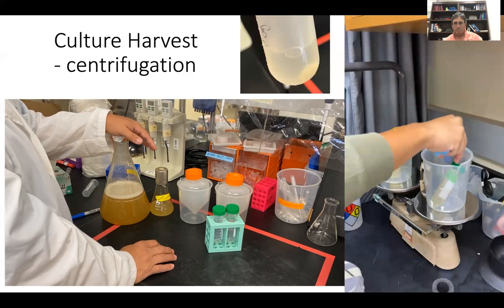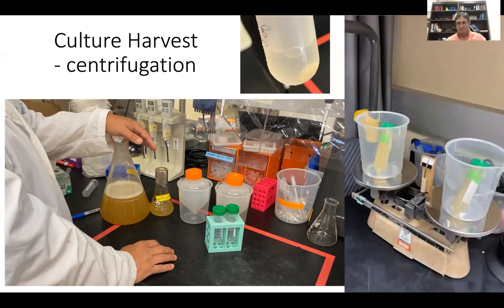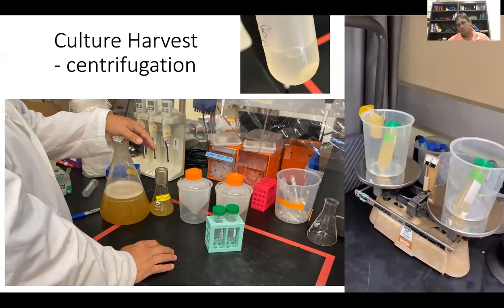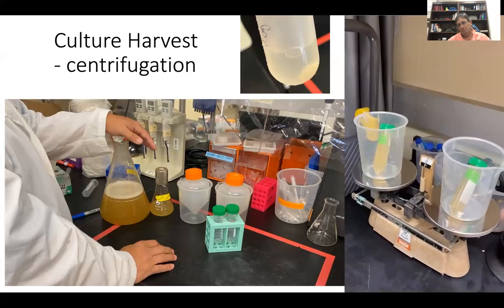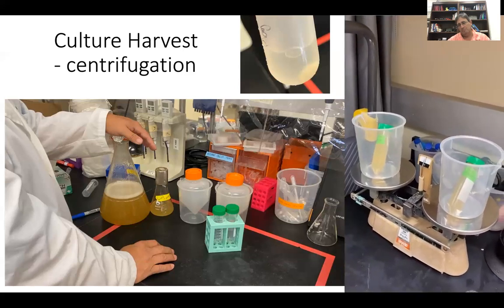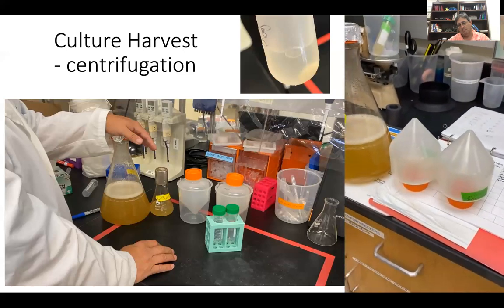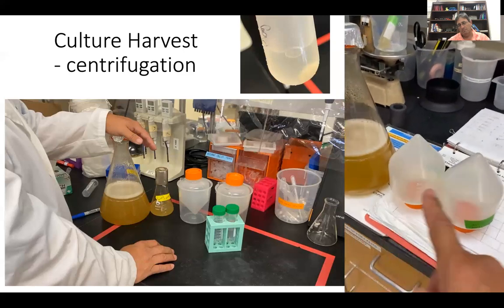We kind of already cheated here. We already know that they're balanced. If they weren't, use a smaller one, put them in there, keep the caps on each balance, and then use a pipetter to even them out. So that one's good to go. Now for this, we're going to centrifuge these down again into these two.